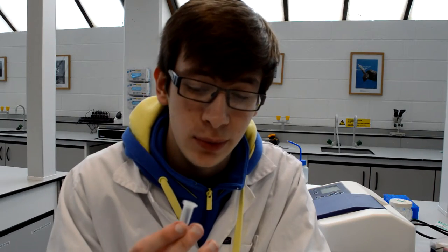Always make sure that you label your tubes on the cap, otherwise you'll have issues recognizing which is yours. You haven't got a huge amount of space, so using like a little indicator like a triangle or a square or a star is a lot easier than writing your initials. Or even if it's just make the entire cap black, that works as well.